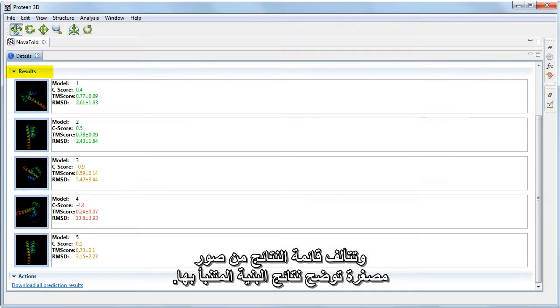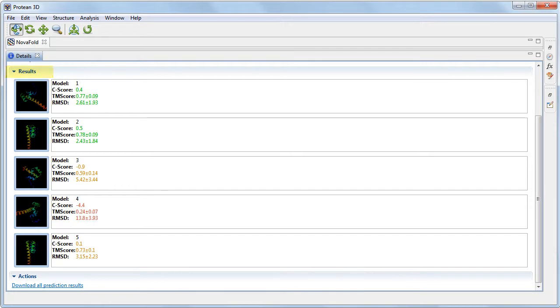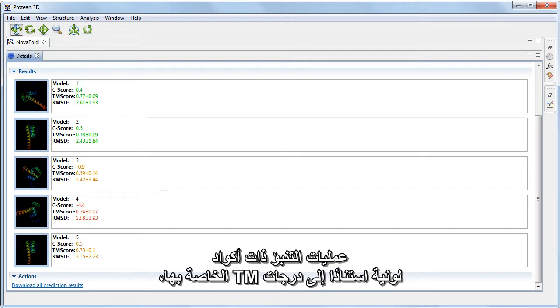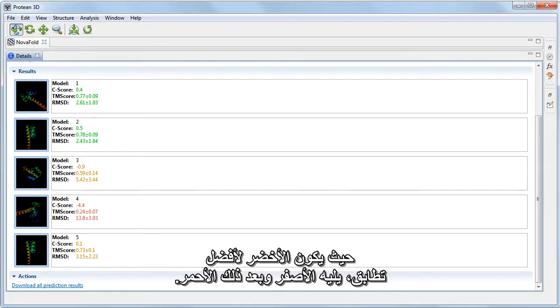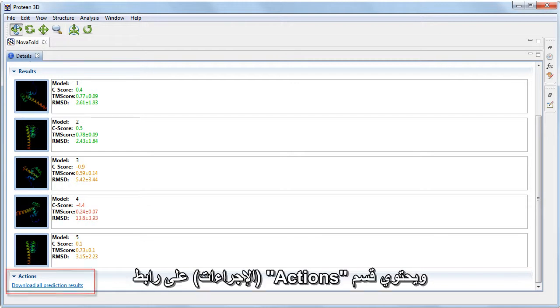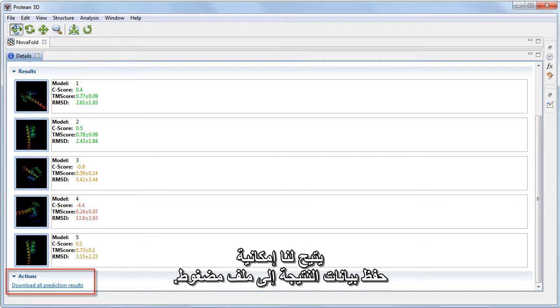The results list consists of thumbnails showing renderings of the predicted structure. Predictions are color coded based on their TM scores, with green being the best match, followed by yellow, and then red. The Actions section contains a link allowing us to save the result data to a compressed zip file.